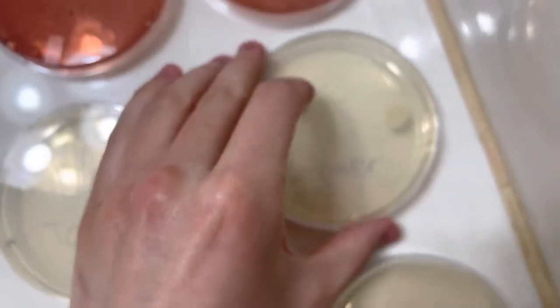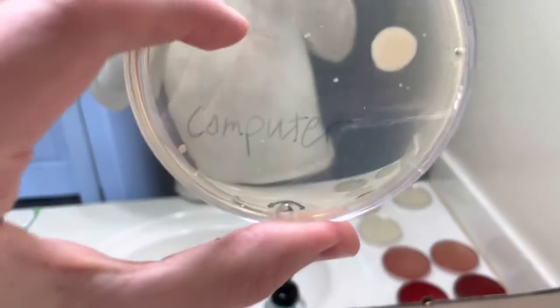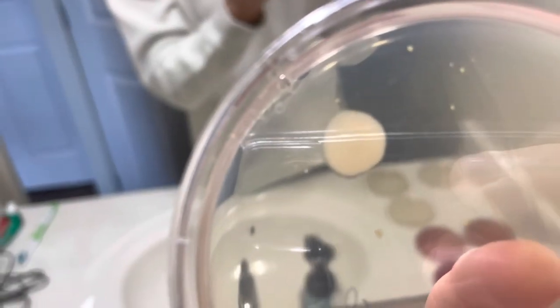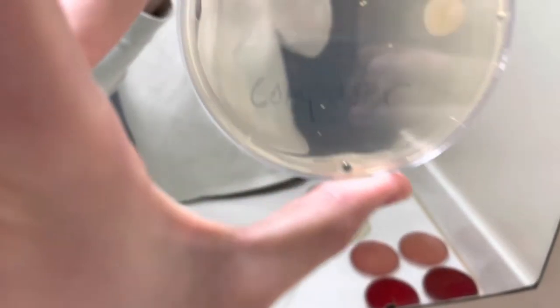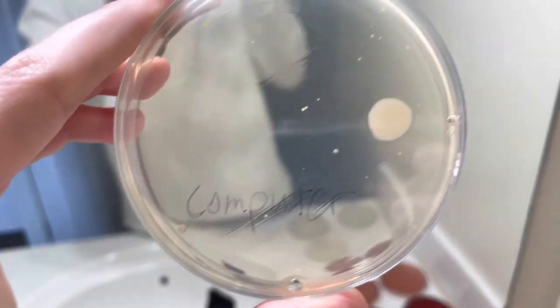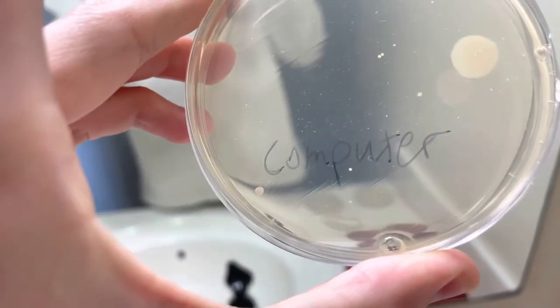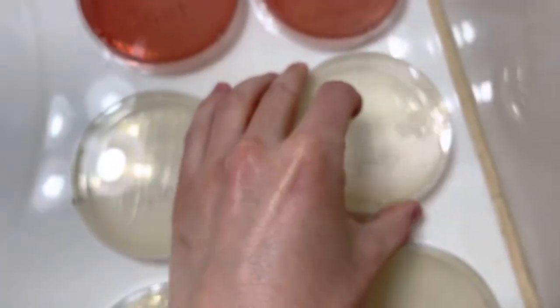Let's see my computer — this is my keyboard. Wow, quite a few things, a massive group. This wasn't actually streaking for isolation; it was simply streaking to see if there was going to be bacteria, and you can definitely tell there were quite a few different groups. You can see some different colors, different sizes, shapes. So I can't determine exactly what they were, but I can simply see the amount of bacteria growing on there.